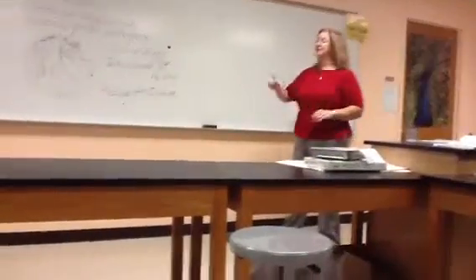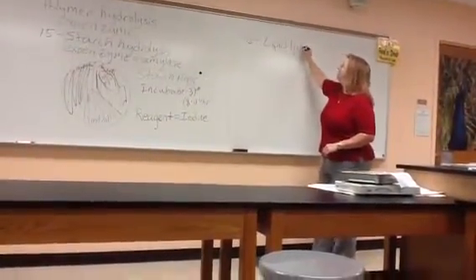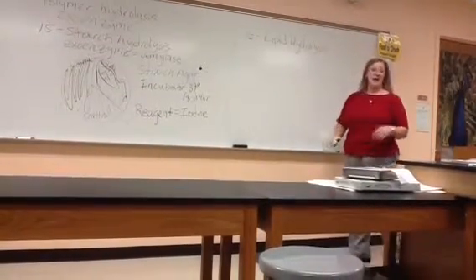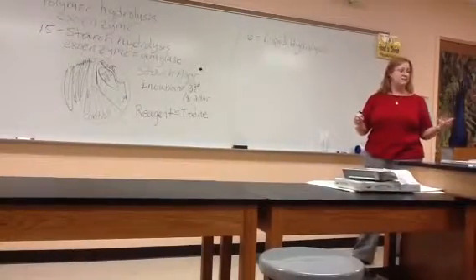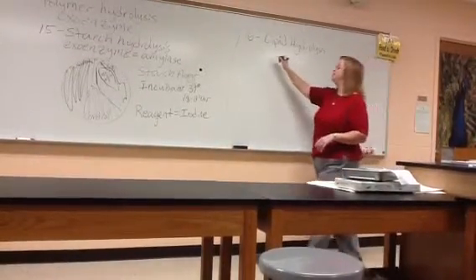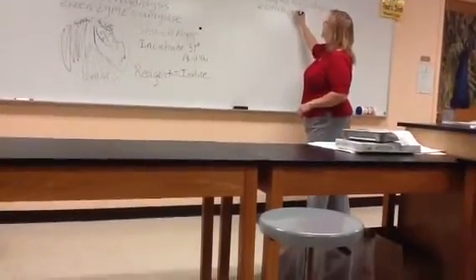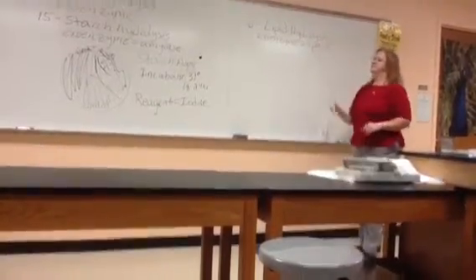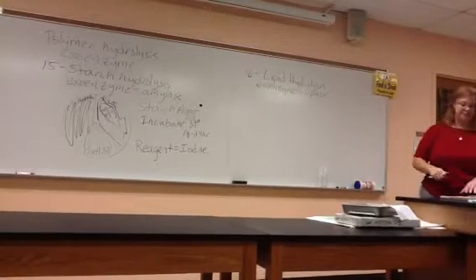16 is lipid hydrolysis. What's a lipid? Fat. And hydrolysis? Breaking down. Adding water and break it down, right? It's the same thing. It's going to be external again. They're going to secrete an exoenzyme to do lipid hydrolysis. The exoenzyme here is lipase. Lipase is the exoenzyme that breaks down lipids.